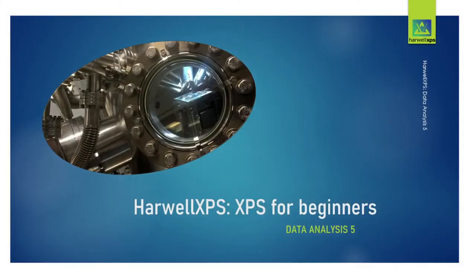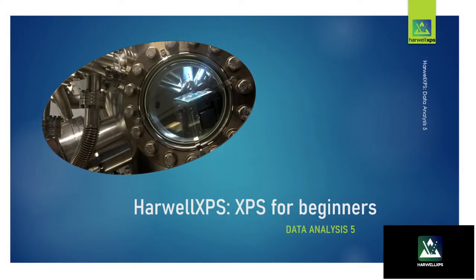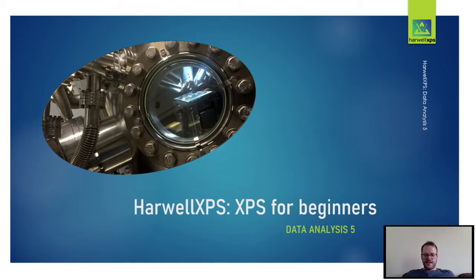Welcome to this part of our XPS for Beginners course, Data Analysis 5, and we're going to be going through some stuff on doublets and how we would look to process these.